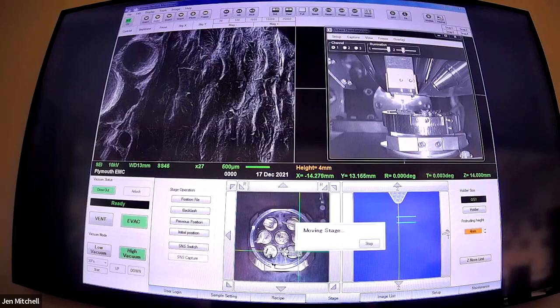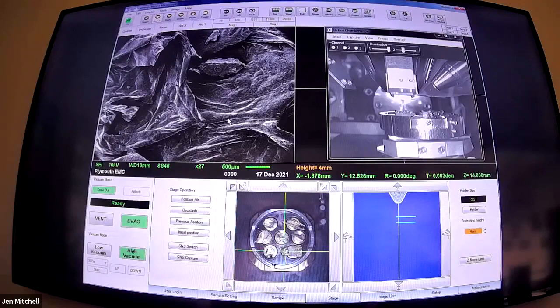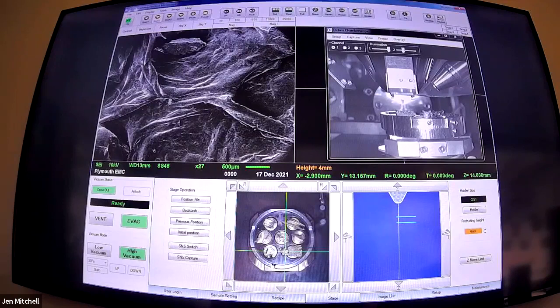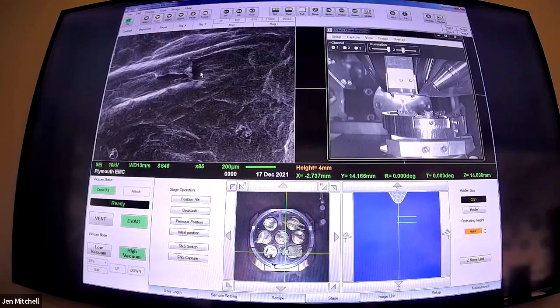Let's go back to the first part - this is like the inside of the orange, that orange bit that you eat. Juicy vesicles - unfortunately completely now devoid of juice. But if you imagine these like full of water, it makes a bit more sense - kind of like balloons. This piece was handily sliced at a diagonal, so everything's spread out and you can really see the separation of the layers.